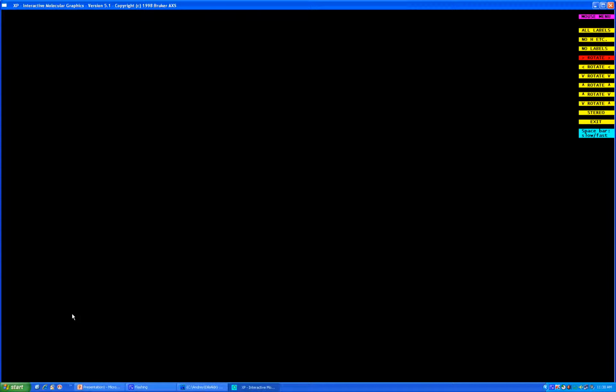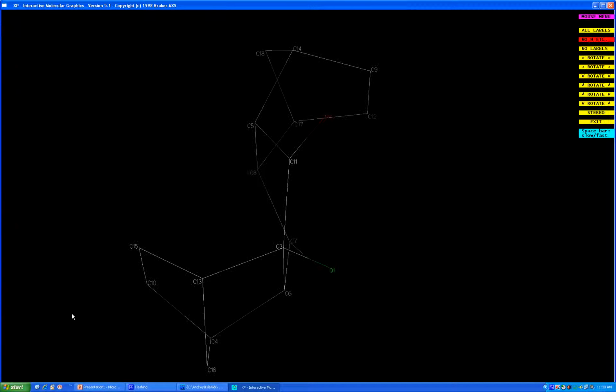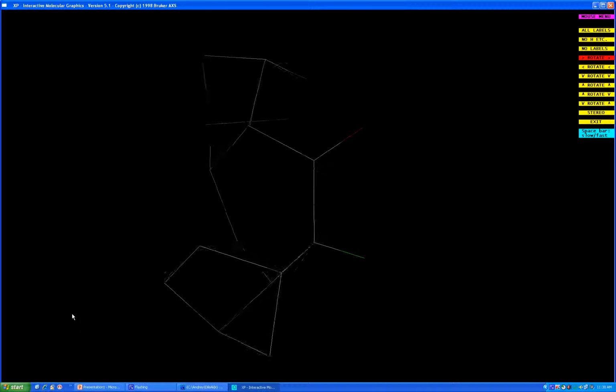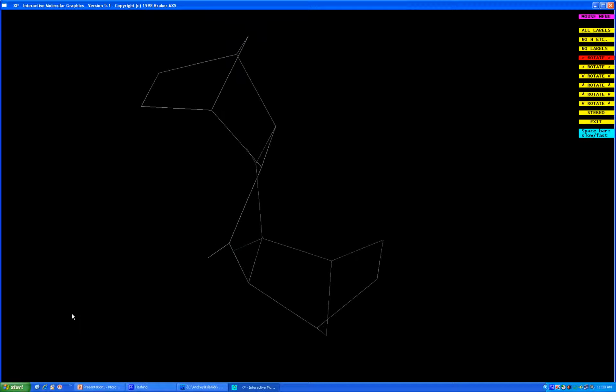Q1. I hate when my structure lags. I'm sorry. Let me try to do it again. It never lags when I'm doing structure solution without video recording.